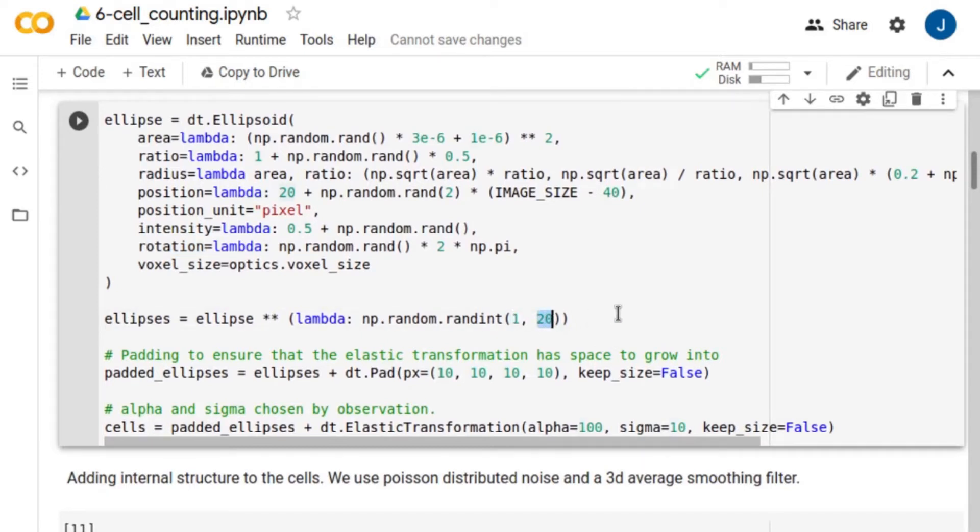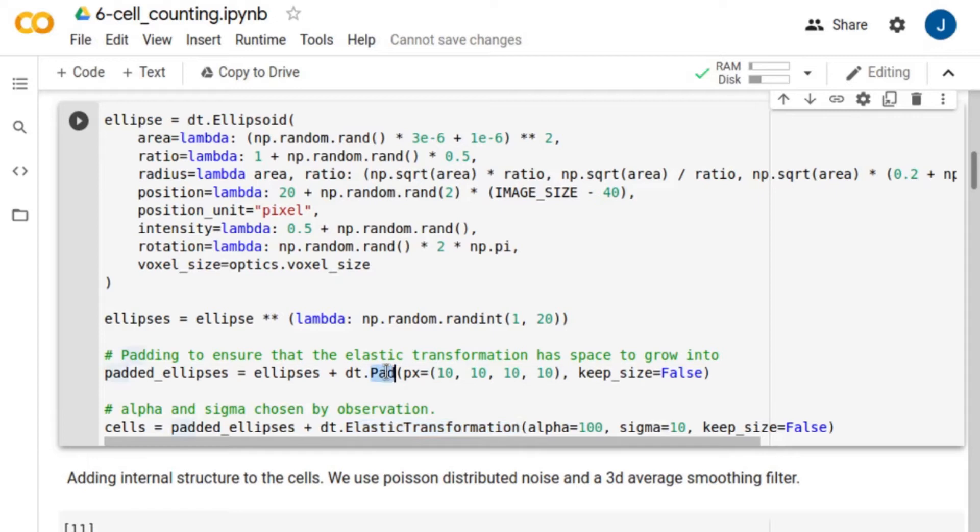We apply elastic transformations to the ellipses to make them look like real cells. However, first, we pad the ellipses to ensure the transformation has enough space to grow into.